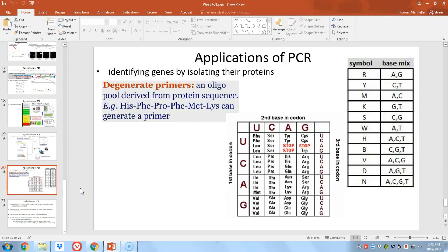So a number of you had commented in your weekly reflections from this week that the concept of a degenerate primer was the most confusing from this lecture. Not hard to figure out why that was. It's the last slide of the day. We were running a bit short on time. Very much went through that far quicker than it should have gone through.